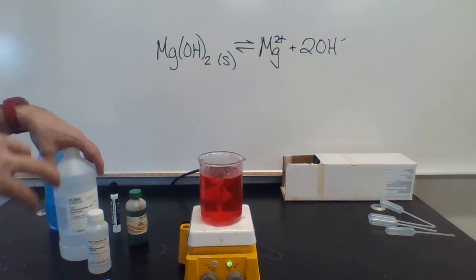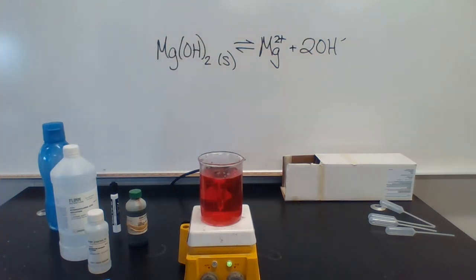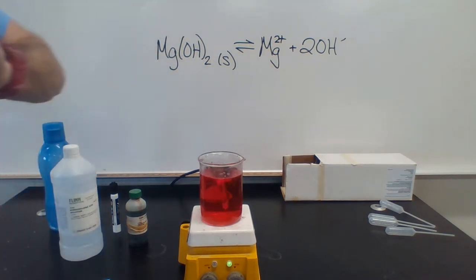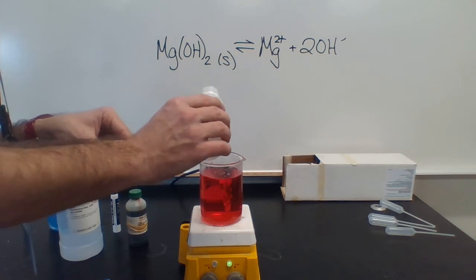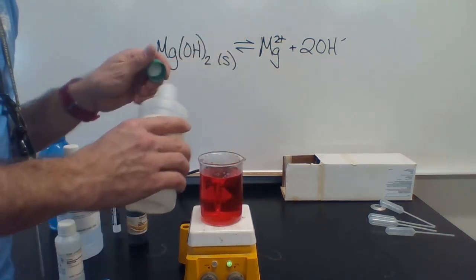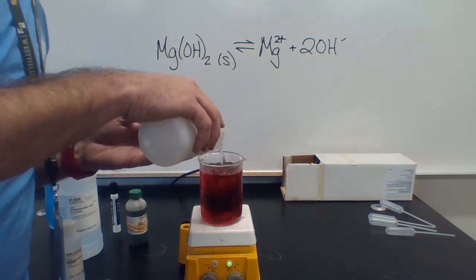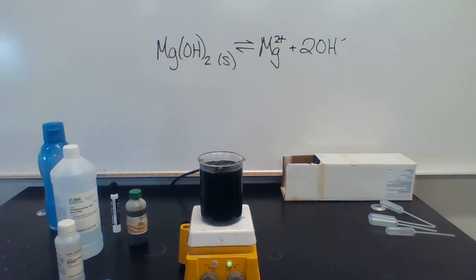If I added tons and tons of acid, that would be like removing my base, removing my base, removing my base. And as a result, in the attempt to get back to equilibrium, the reaction will shift and shift and shift. And I'm not sure if I can go back the other way if I have enough hydroxide there at all. So what I'm going to grab instead, so it'll be a little bit different from what we'll see on our paper, is some sodium hydroxide. When I put hydroxide in, we see that it goes purple, but there's enough acid to neutralize that. But I can add some more of one of my things, causing it to go back towards that direction.